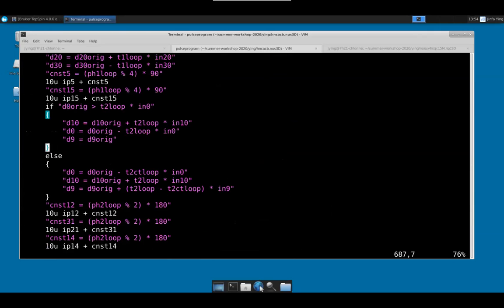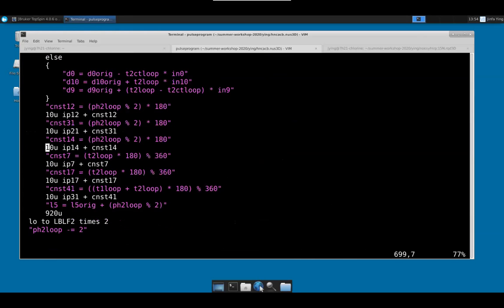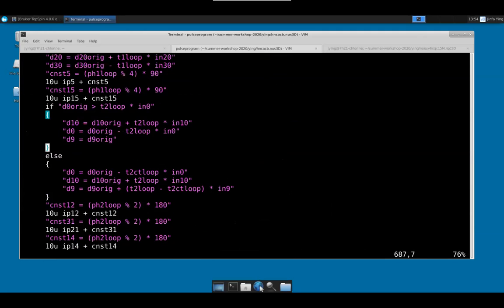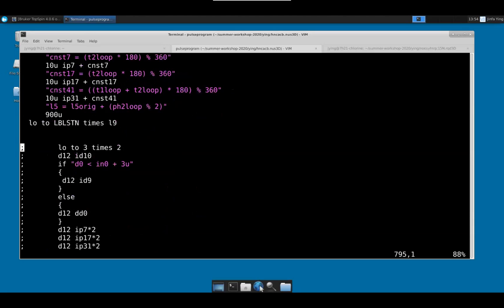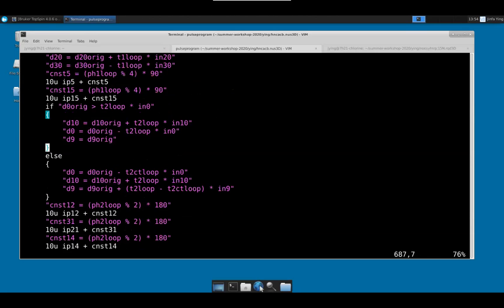It's not even RQD, RPD, not single partial component. So you need to have a lot of loops. First a T2 phase loop, and then a T1 phase loop, and then you end up with an increment, okay? 3 loops. And you can look at this later if you're interested.